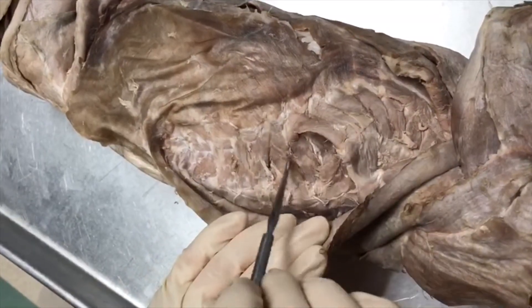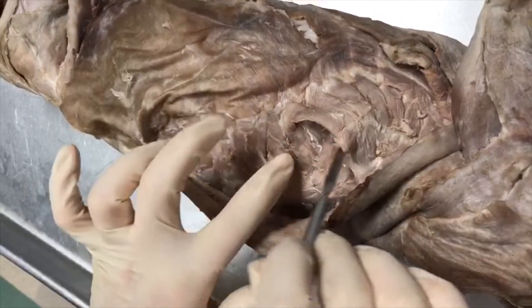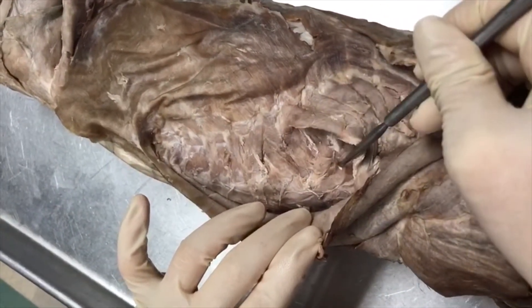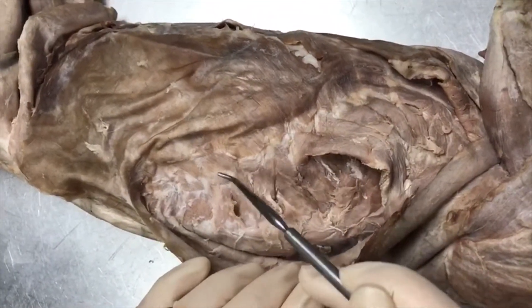The serratus dorsalis cranial is going to be up here — these muscles running at this angle. And the serratus dorsalis caudal are going to be these muscles running at this angle.